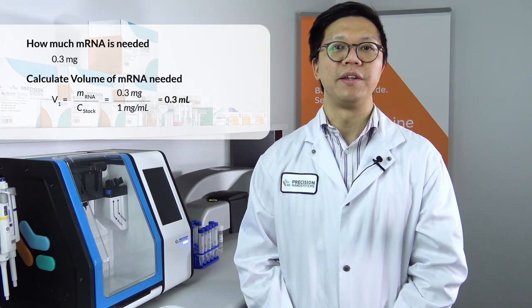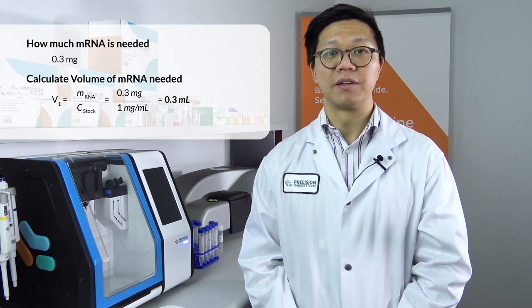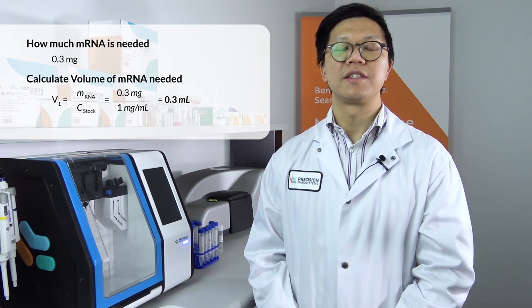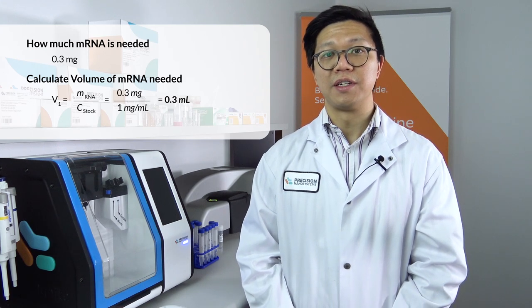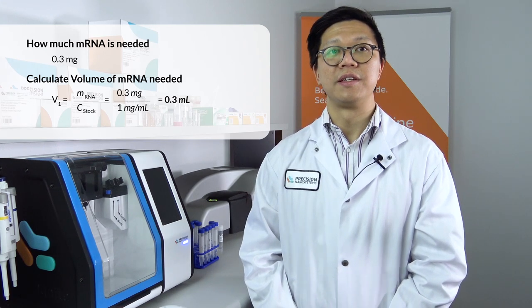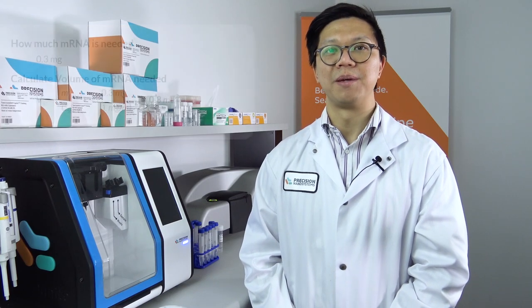So at first, you'll need to measure enough RNA for this encapsulation. Typically, when you order your mRNA, it'll come in roughly 1 mg per mL concentration. And then, using this equation that you see here, you can calculate the volume that you're going to need. In this case, since we're doing 0.3 mg, we're going to need 0.3 mL of mRNA.